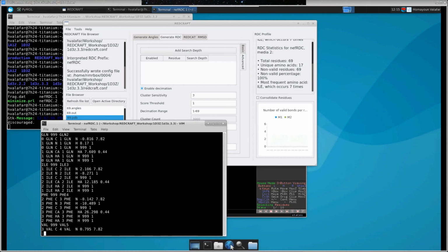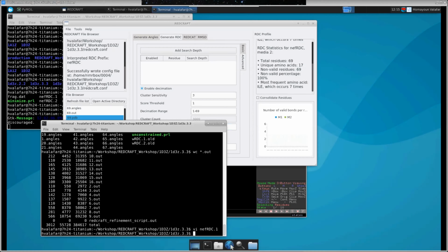So does it affect your final convergence, or the RMSD? It is purely based on residual dipolar coupling data and no other information. I'm sorry I don't have that, but I'm almost sure somewhere in here I have a run where we are only using NH and C alpha H alpha residual dipolar couplings. And in fact, it works better than using three. Because the carbonyl nitrogen is really a smaller magnitude collection and it's more erroneous. So when you include that in here, the quality of the final structure is reduced a little bit.